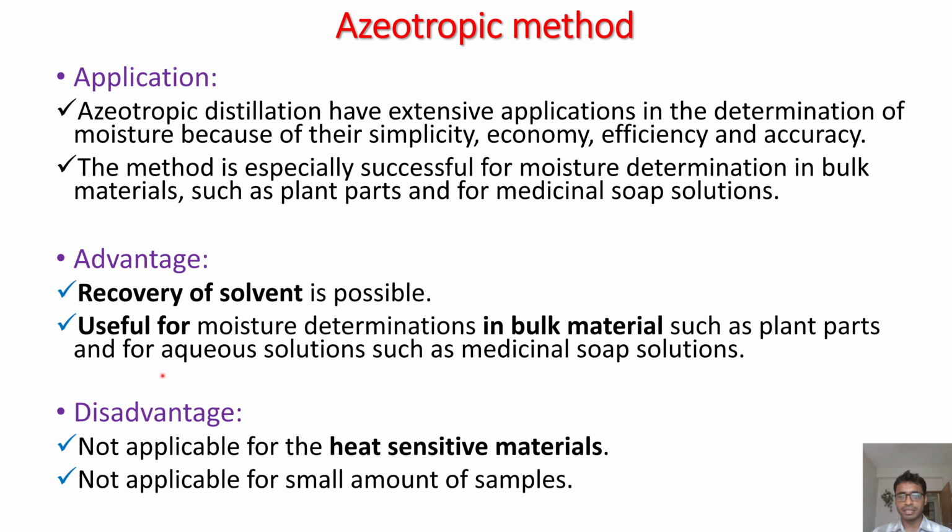However, there are some disadvantages, like it's not applicable for heat sensitive materials and not applicable for some small amount of samples. Okay, so these are some pros and cons of the azeotropic method.